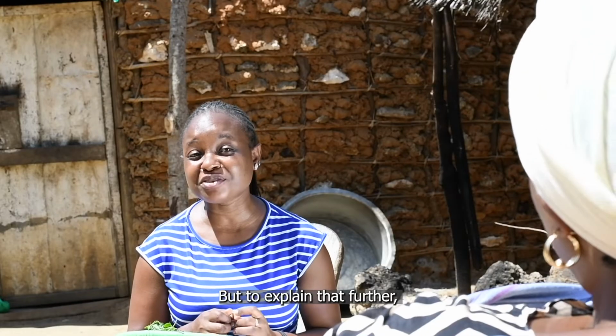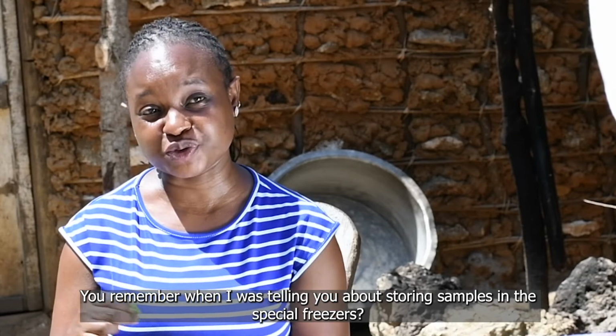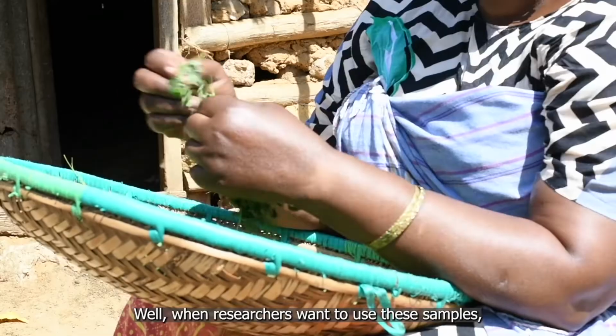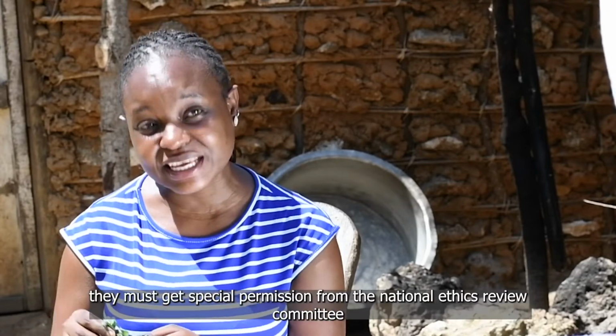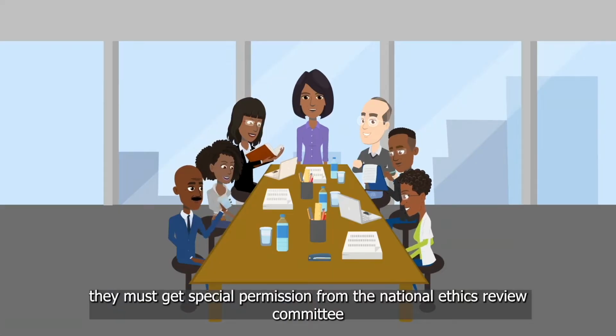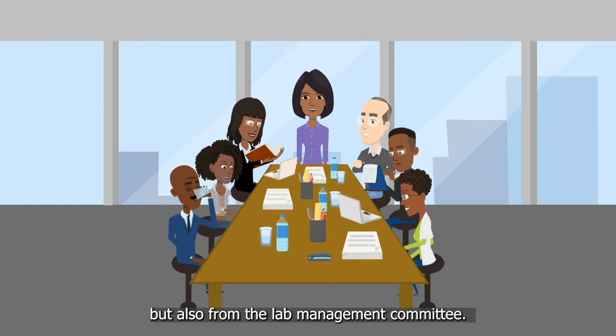But to explain that further, remember when I was telling you about storing samples in the special freezers? Tell me more. Well, when researchers want to use these samples, they must get special permission from the National Ethics Review Committee, but also from the Lab Management Committee.